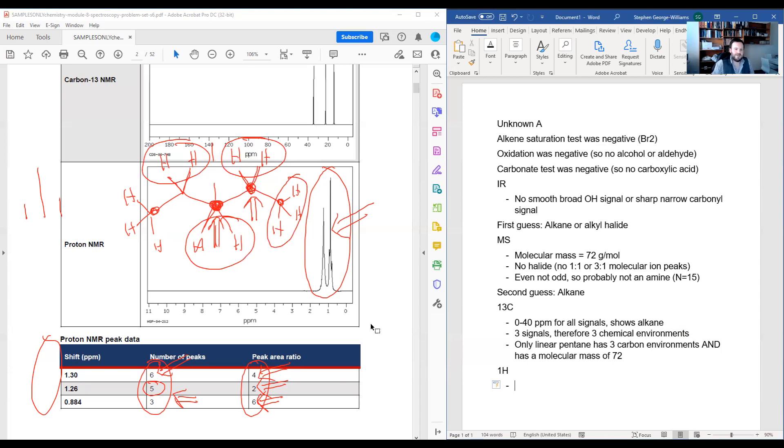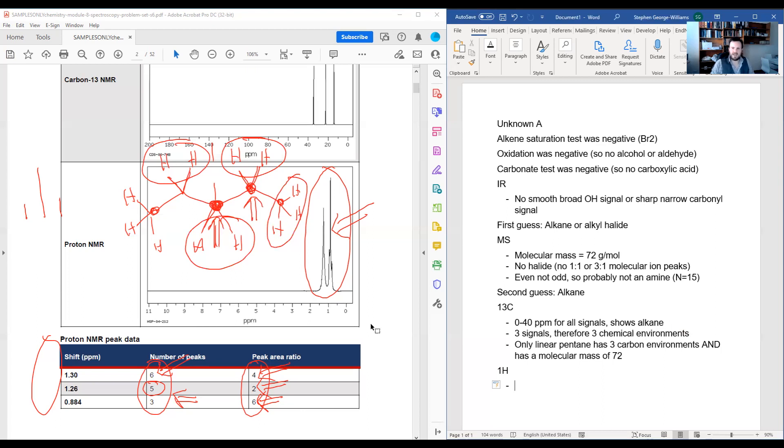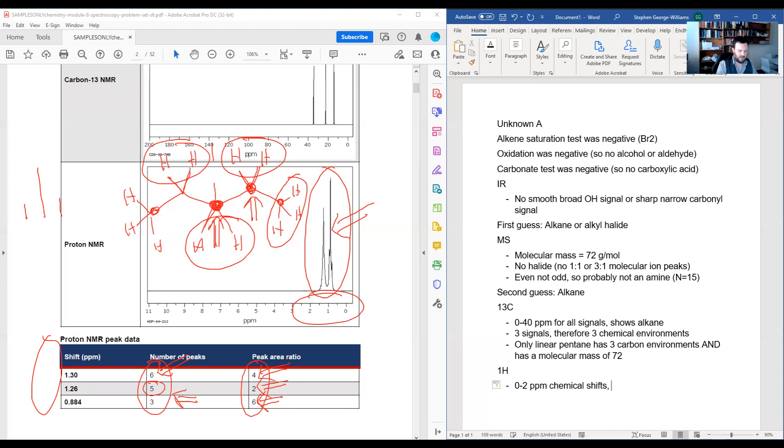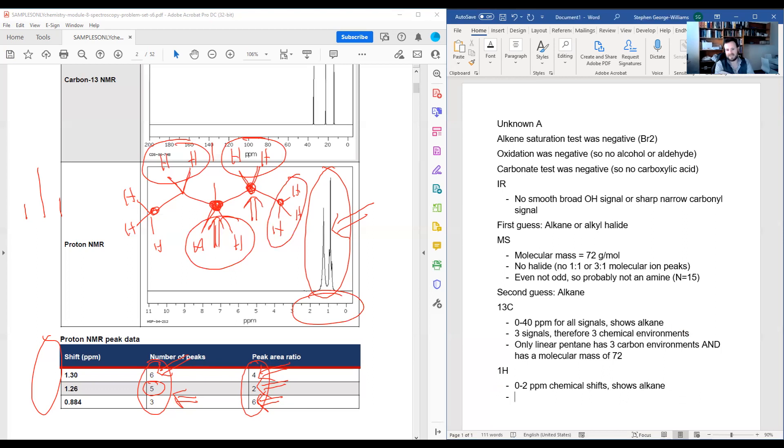So really, I've gone ahead and pulled out all that information just to confirm, but it doesn't really tell me anything new. Just make sure that yeah, it definitely is pentane. So again, going to my sheet here, what would I write? Well, I'd point out that my chemical shifts 0 to 2 ppm shows alkane again. That matches up with what we thought.